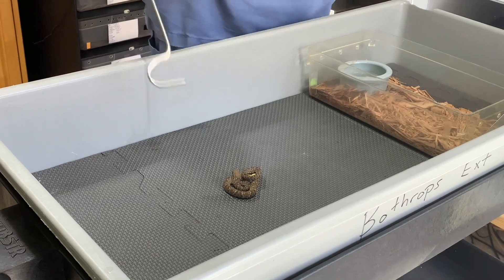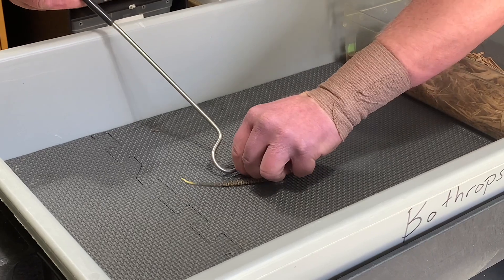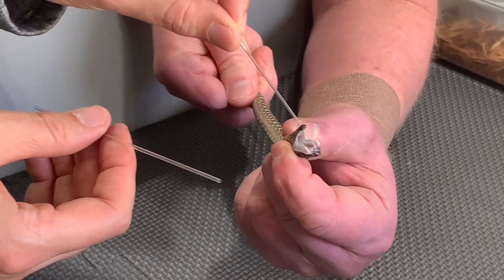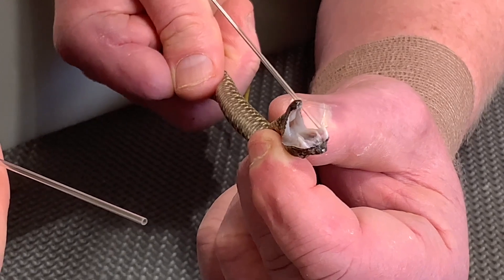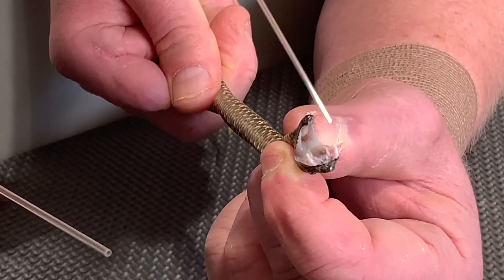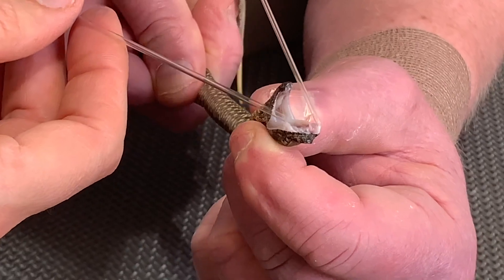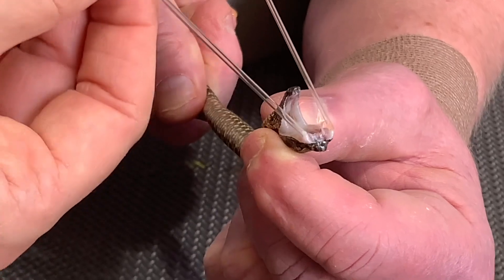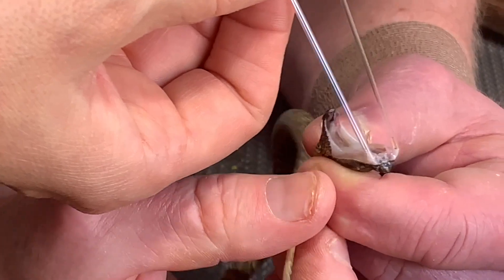Now we're on to the juveniles. Hard to believe that these little things can grow up to be as large as these adults. What we're doing here is extracting venom for a particular project that's interested in ontogenetic change — from babies to adults. So what that means is, how does the venom change from the juvenile to adulthood? We're providing venom from this baby and from the mother and father, which were the first two snakes in the video.